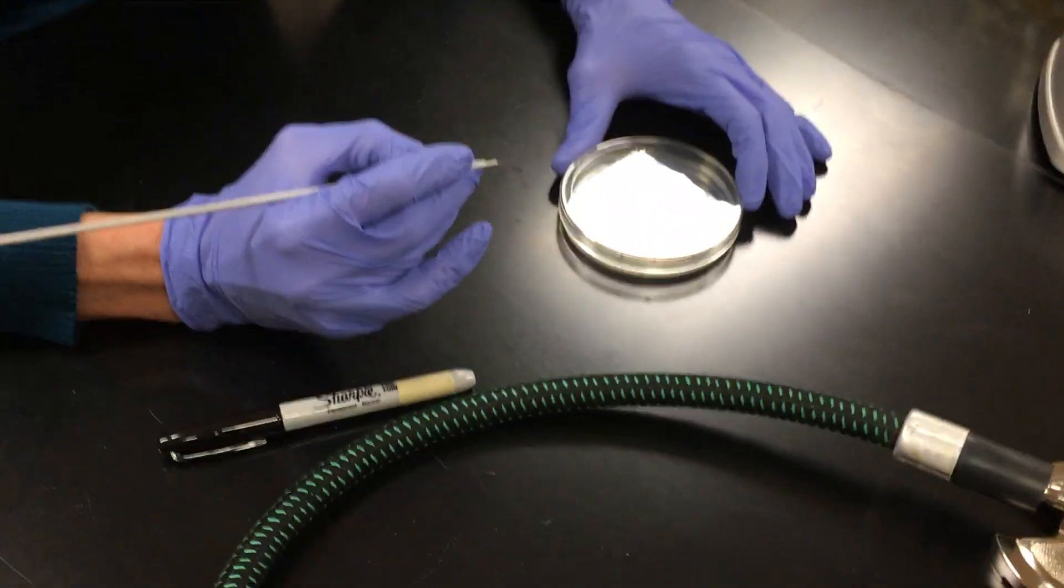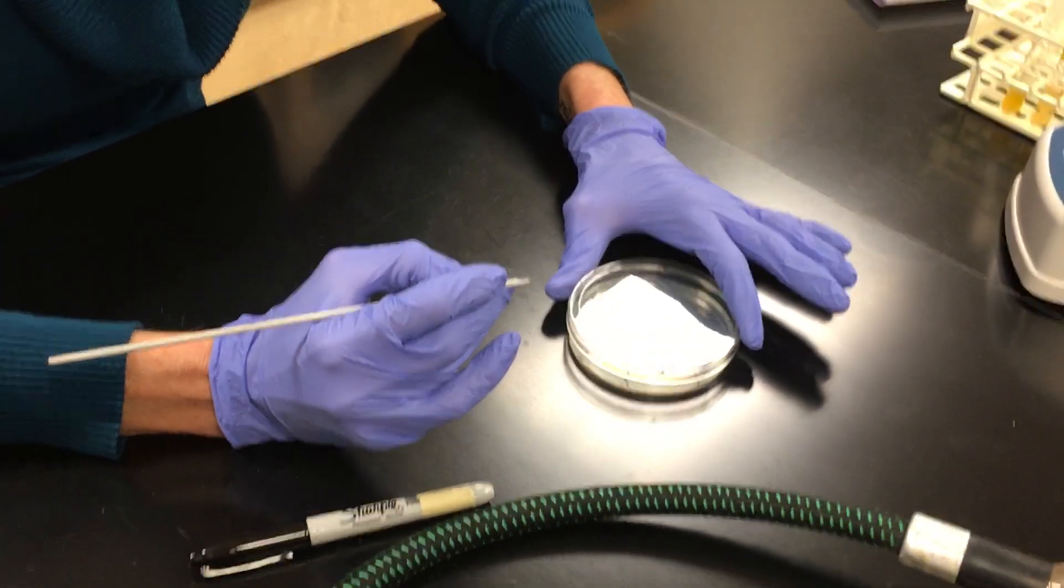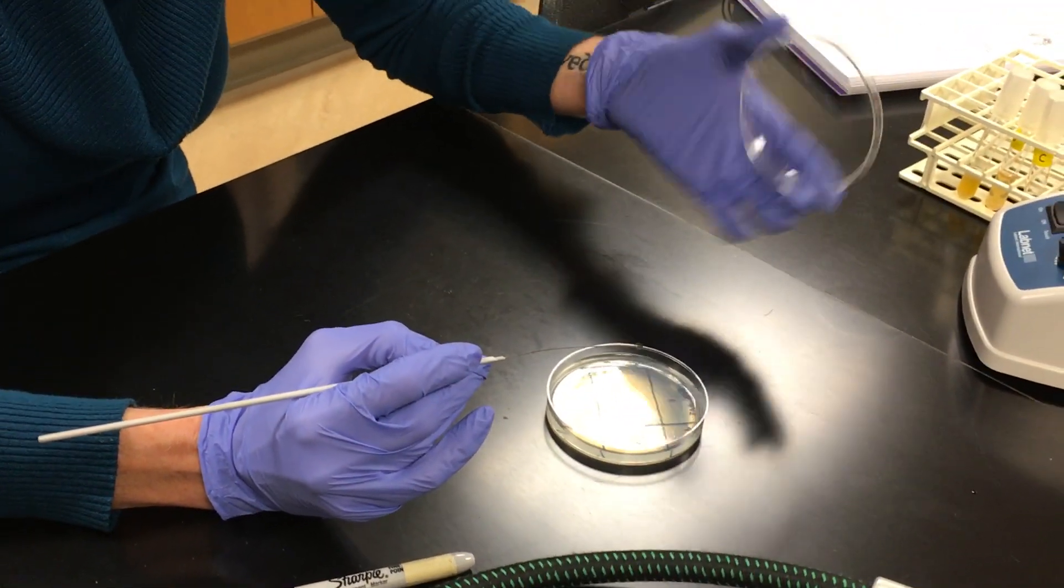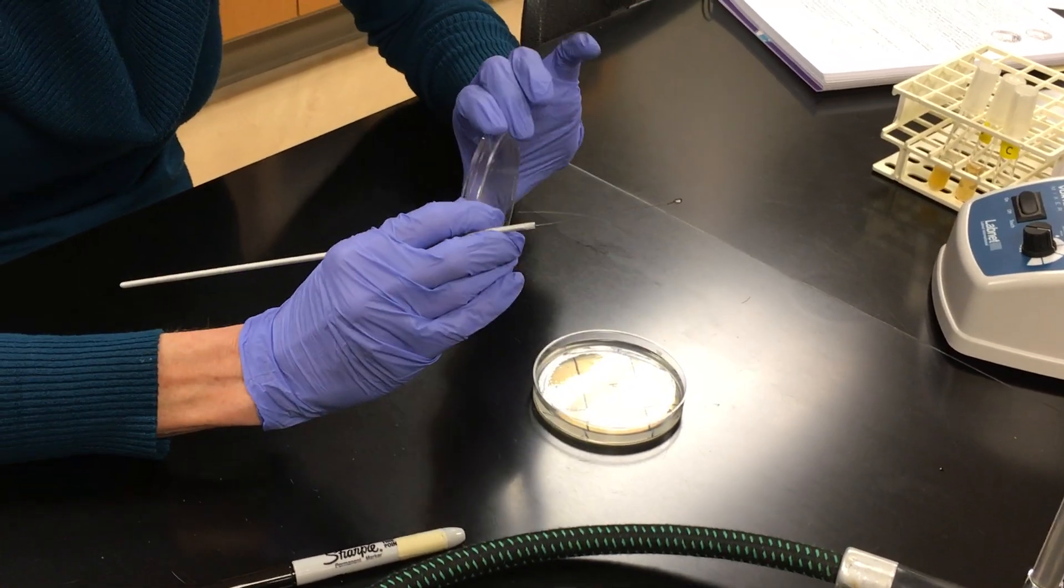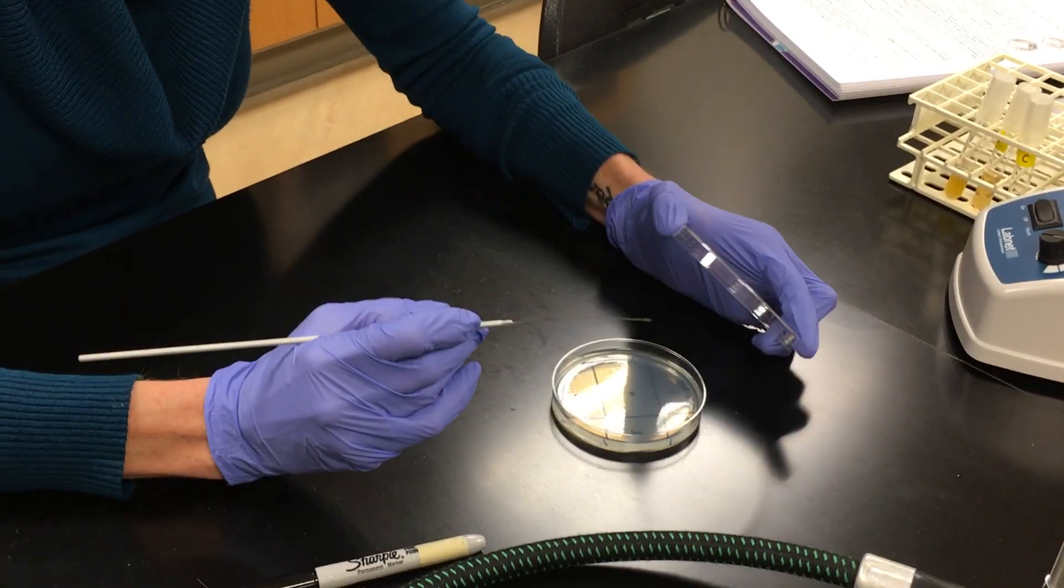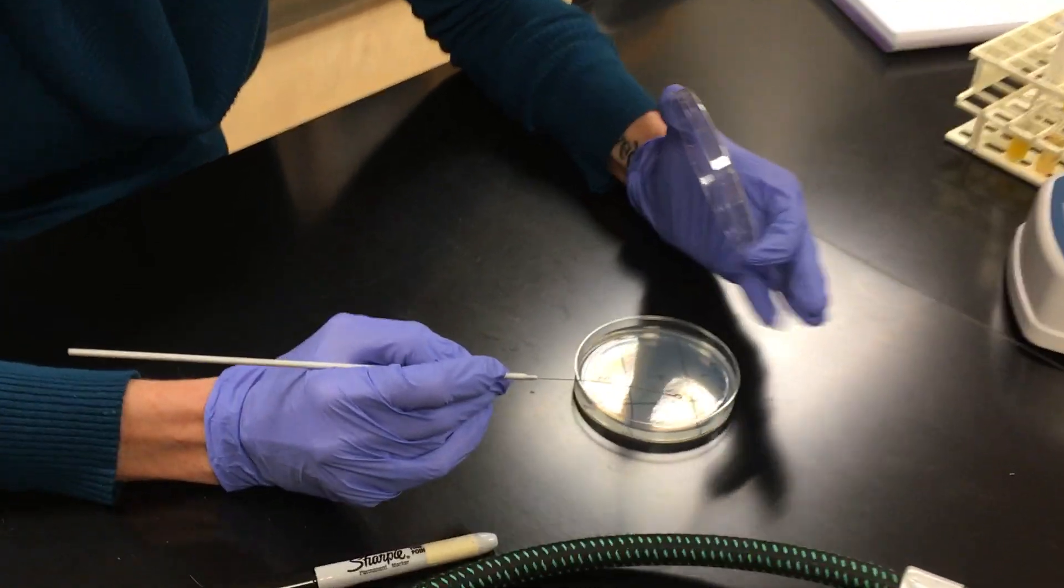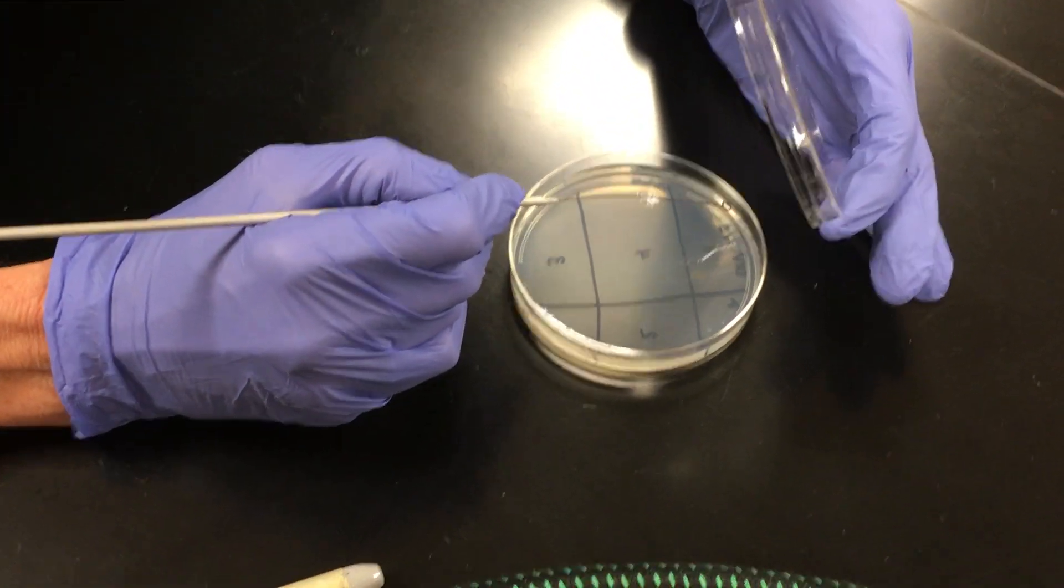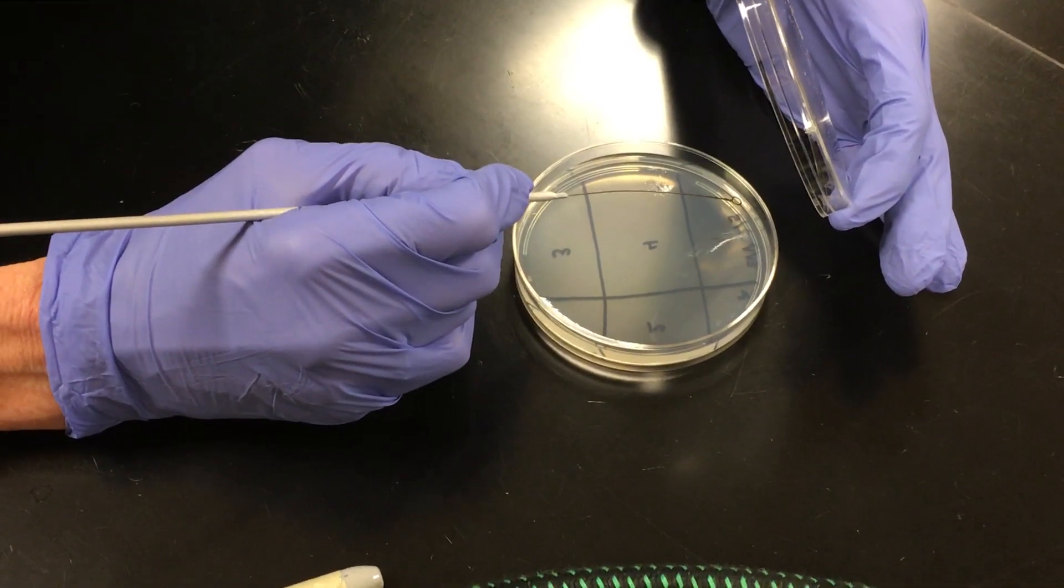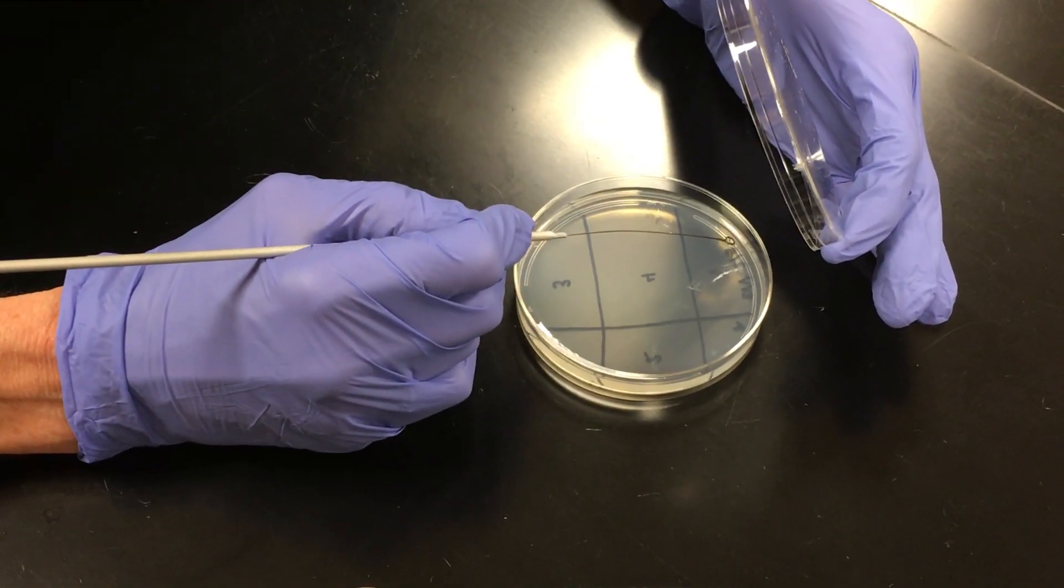So now it's time to streak our plate. So we have the lid. We never want to wave it around. We don't ever want to put it down onto the lab bench. We're going to use this lid as a shield because there are contaminants in the air. We don't want them to get on our plate. So we're going to begin in quadrant one.